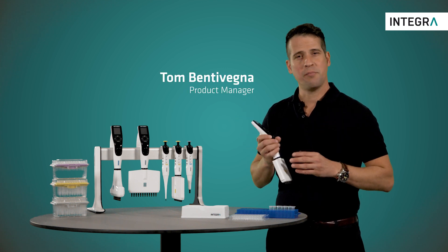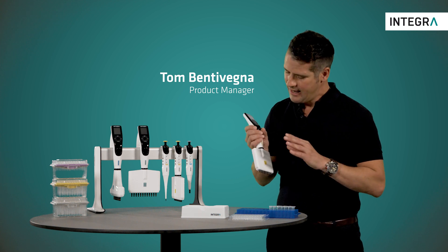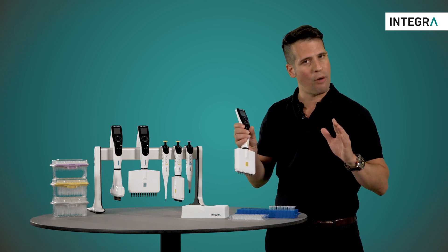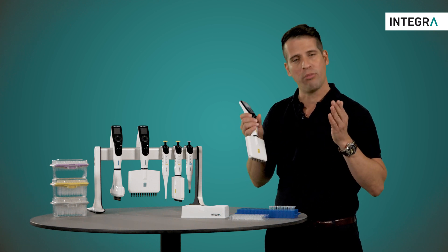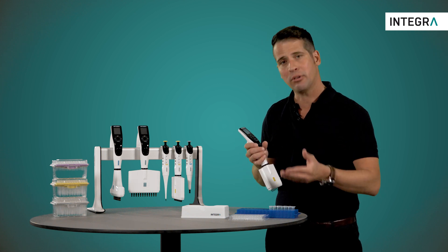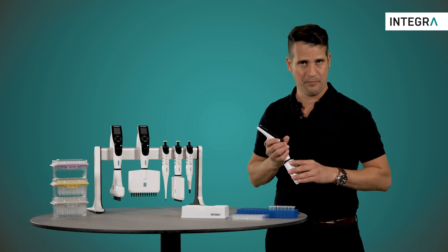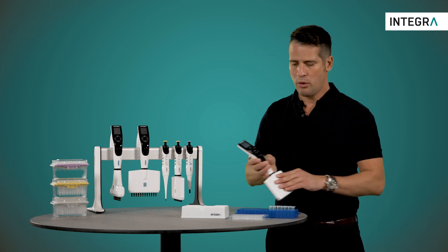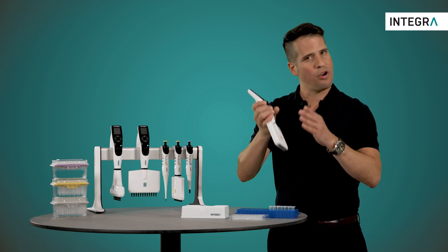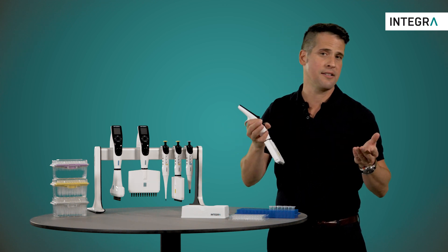One of the more common applications being used in labs today is the serial dilution. Integra electronic pipettes offer a mode which will help you carry out all pipetting steps required to perform a dilution — for example, adding diluent to the plate, adding sample to the plate, mixing them together, and then carrying out the dilution. With this pipette, you can aspirate a specific volume of sample, carry out your mix sequence, and when you're finished, your first aspirated volume remains in the tip as a last dispense.